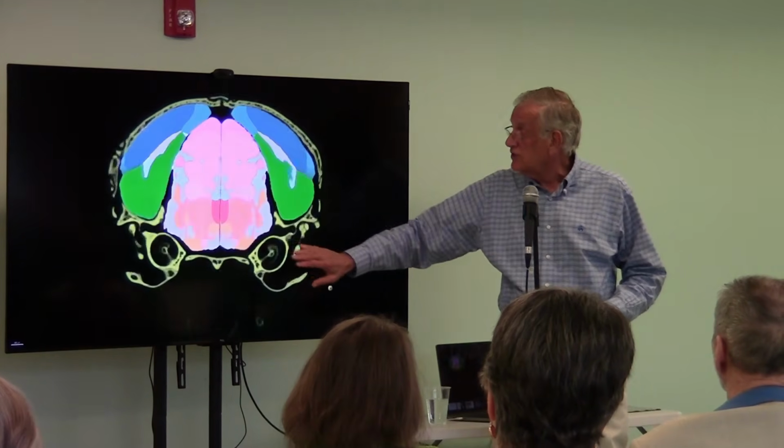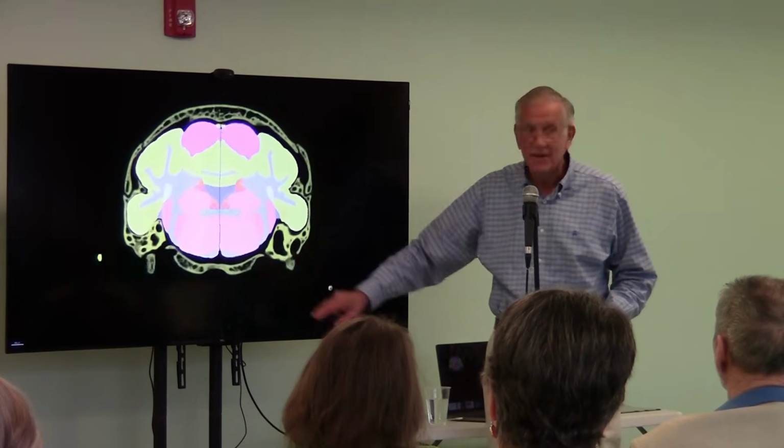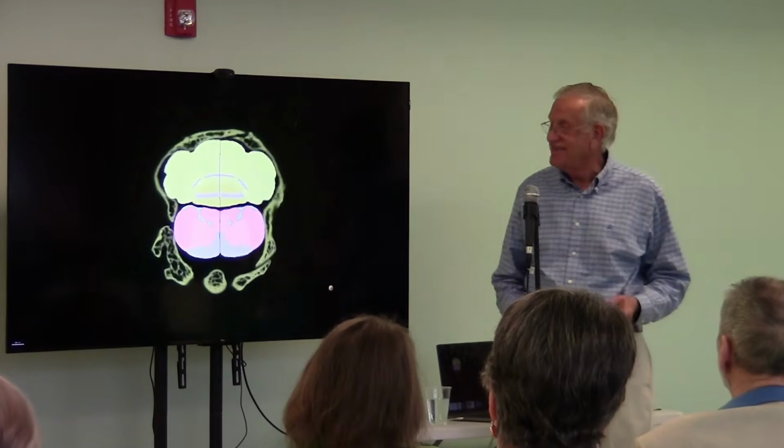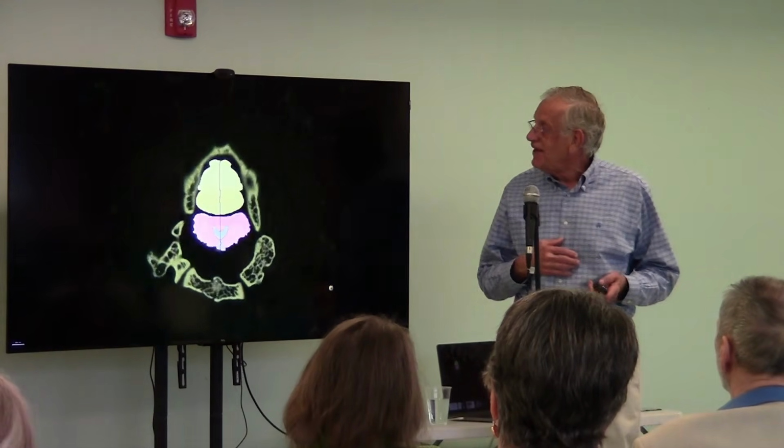This is the skull, still in place. Oh, look at the ear. That was the cochlea of the ear that just went by. Jesus. Yeah, it's fabulous.